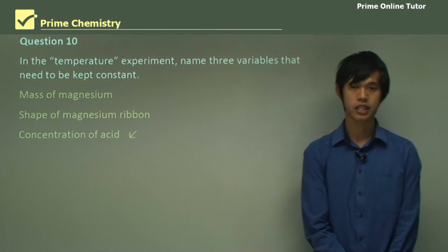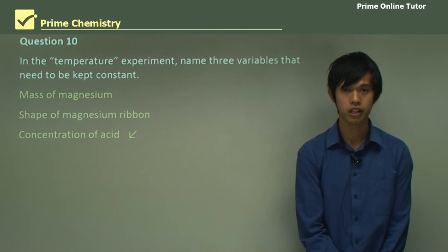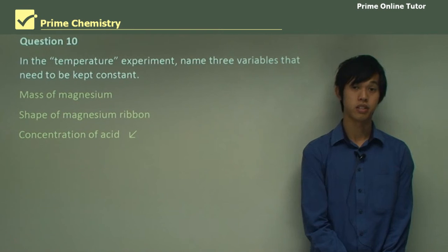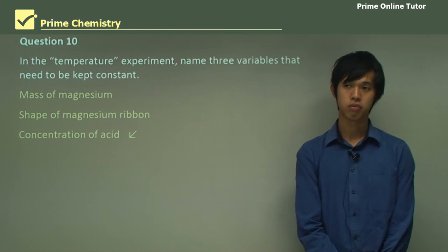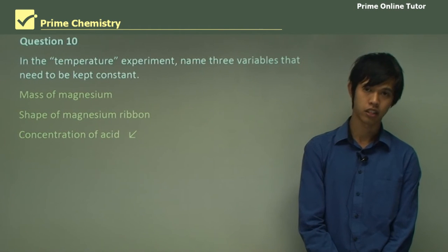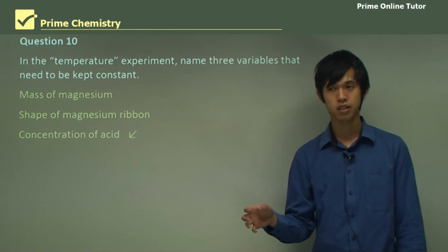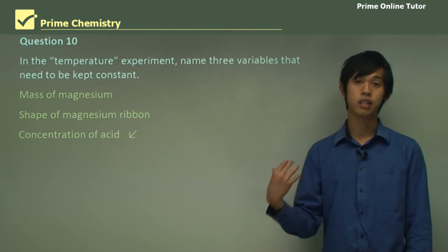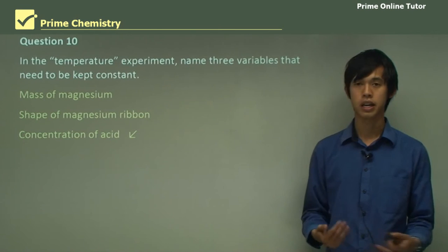So that concludes today's lesson on the first-hand investigation for factors that affect reaction rate. We looked at 3 practices that you can do in your lab that involve reaction rates: modifying the temperature, changing the concentration of reactants, or changing the size of solid particles. And we looked at the typical results and safety issues associated with this prac.